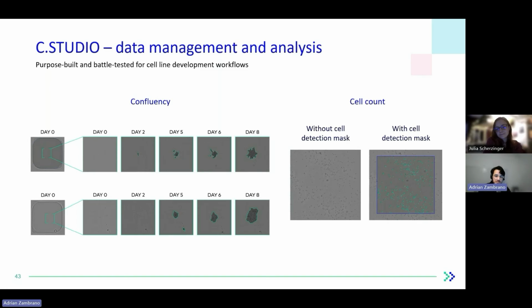I've come to the end of it, and I want to summarize some of the content. It's clear that optimization steps will depend on the cell line of interest, right? Even if you just talk about specific CHO cells, they will be genetically engineered, and their viability and survival rate will depend on so many things, such as the cloning media, right? And that plays, I would say, a significant role in clone recovery. After we have demonstrated to you that you can optimize that clonal recovery, I think it's a nice guideline of what to look into.